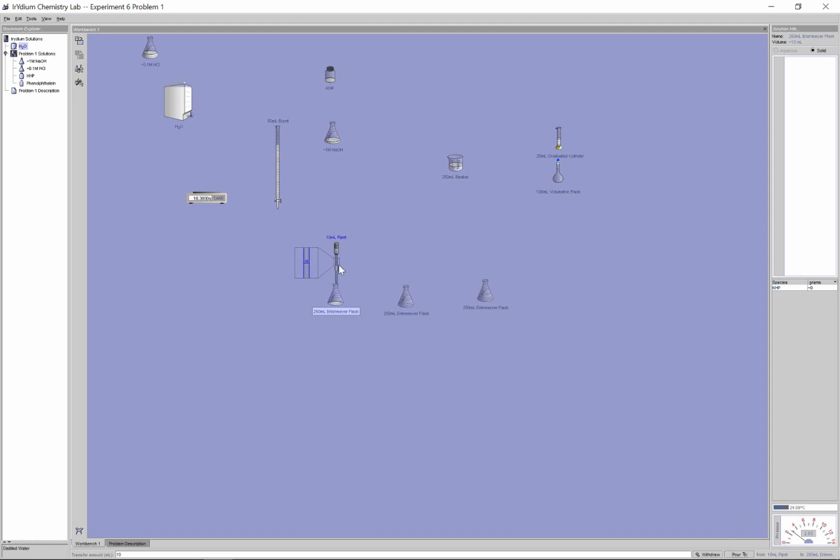As I'm doing this here, I'm actually getting a few different what are called aliquots. Aliquots are the fancy name for a fraction or a sample, a portion of your stock solution. So I'm going to pour 10 into each of these flasks. I'm just getting ready for 3 titrations. So 10, I'm going to withdraw it. Each of these solutions is referred to as an aliquot. Once you've done that, I've prepared my 3 solutions, and now I'm pretty much ready for my titration.